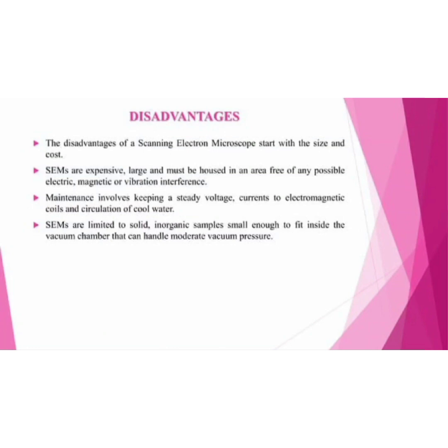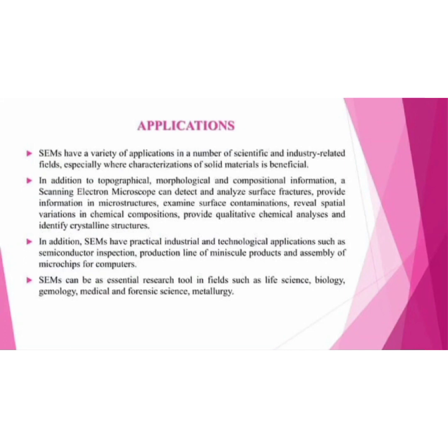Next, it is limited to solid inorganic samples small enough to fit inside the vacuum chamber that can handle moderate vacuum pressure. These are the disadvantages of the scanning electron microscope.